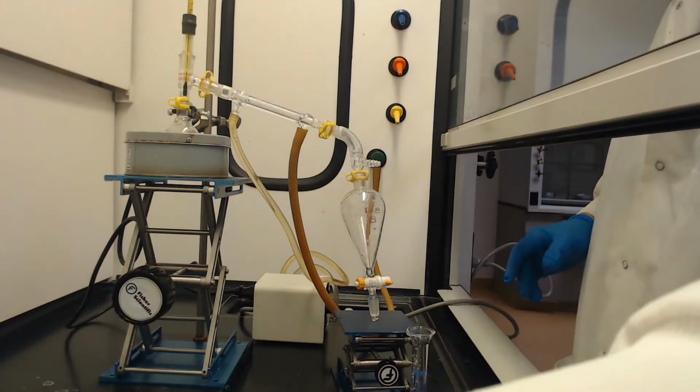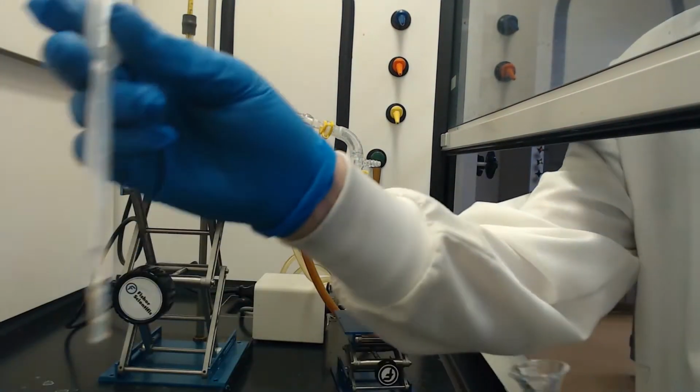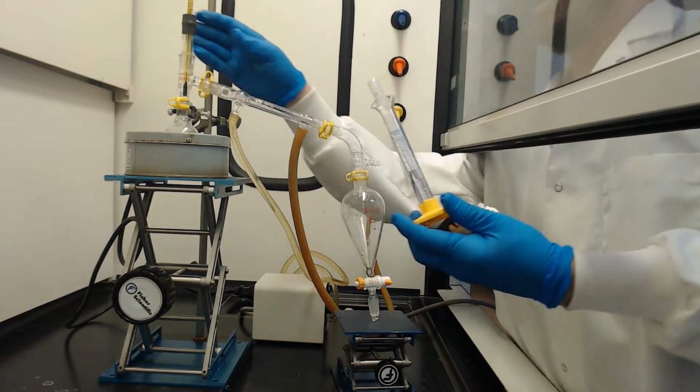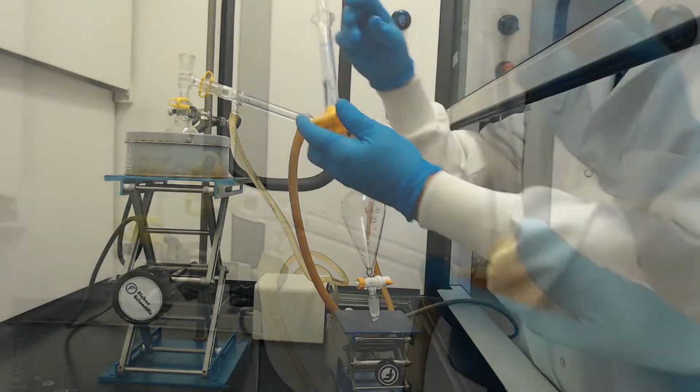Now, the key is how are we going to get this into there? I'm actually going to keep using this. That goes to the bottom of it? Yes, it does. So that's good. I'm going to take off my thermometer here, and that'll be our entryway in.